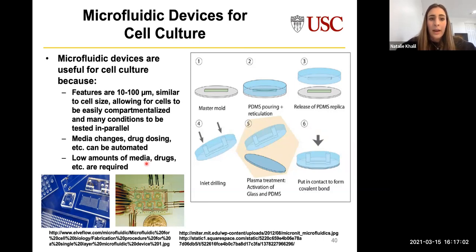And then we can also connect these devices to inlet and outlet tubing, which is demonstrated here, and start to automate some things such as media changes and drug dosing, et cetera.